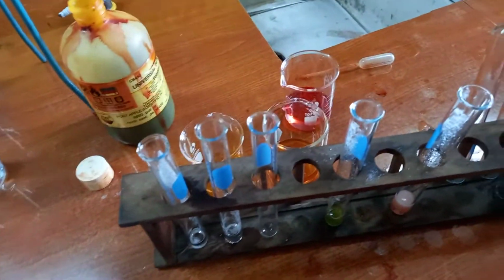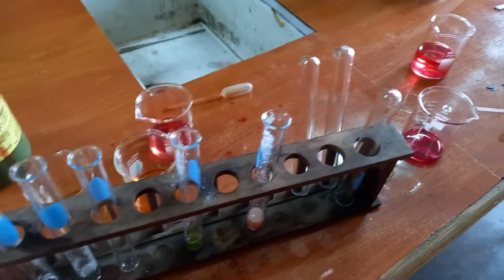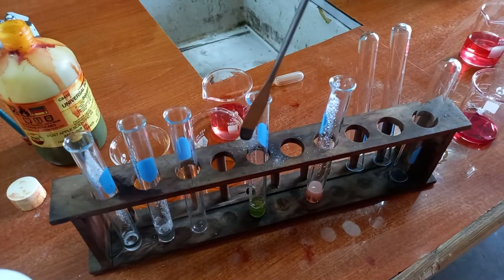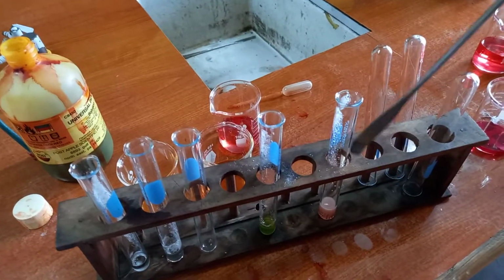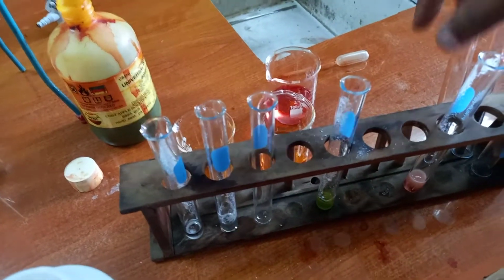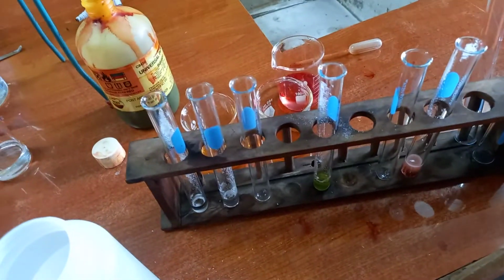So let's go back now to our sample and compare the vigorousness of the reaction between our known aldehyde and our known carboxylic acid, and see which one it is similar to.